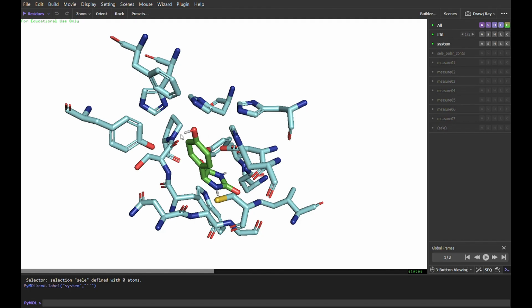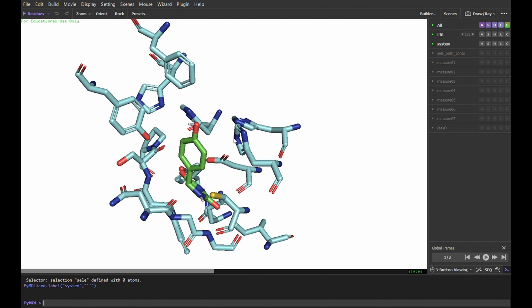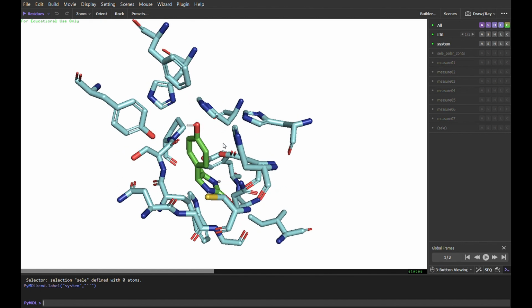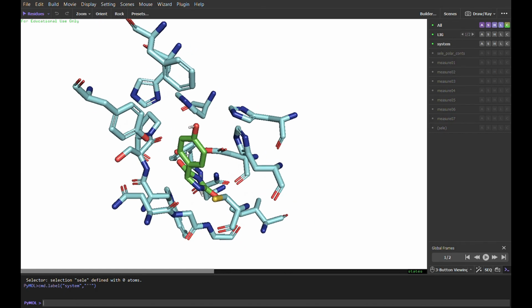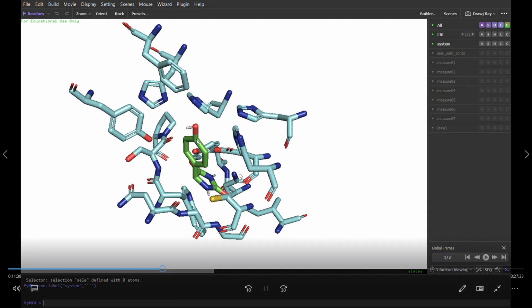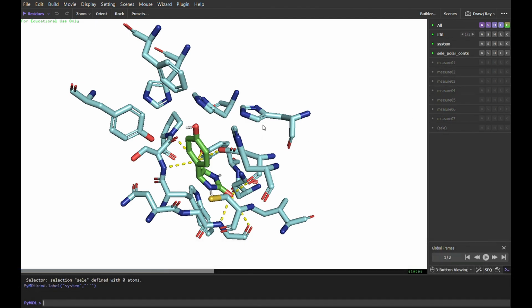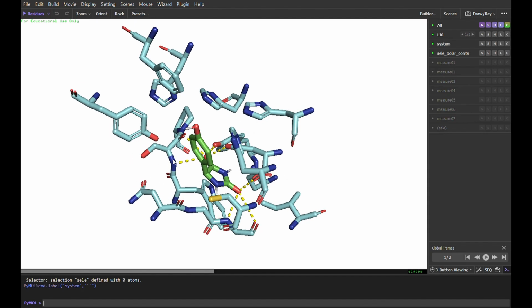And these ones could be in the stereochemistry loops, and they could control the entry of the substrate. So what I do is I first hide the structures that form these polar interactions, you see, and it's what I'm trying to do now.